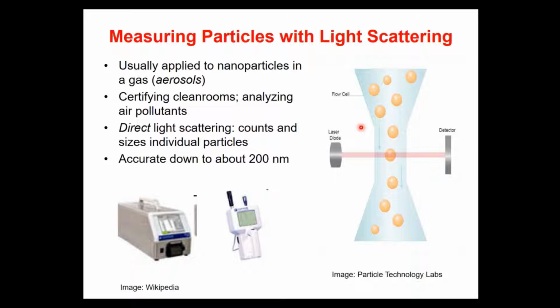The optical particle counter directs particles through a measurement zone where light, it can be monochromatic or white light, is impinging upon the particle. We then collect the scattered light at a detector, and the amount of scattered light is going to be translated into an electrical blip, and that blip will give us a count and a measure of size of the particle.